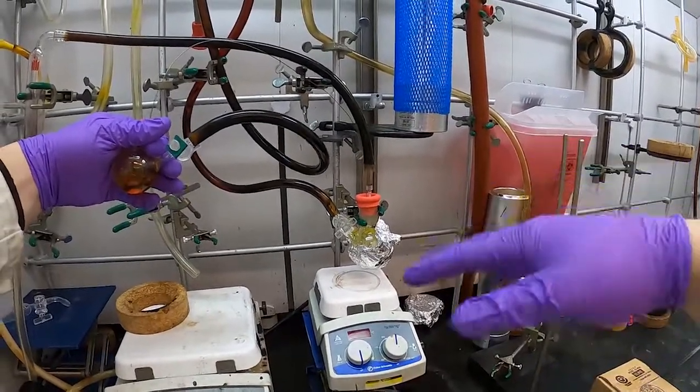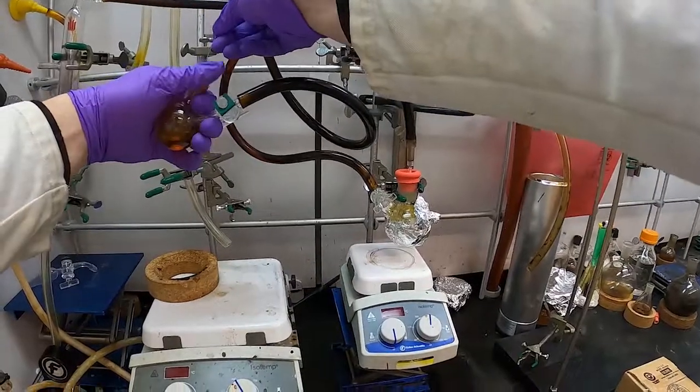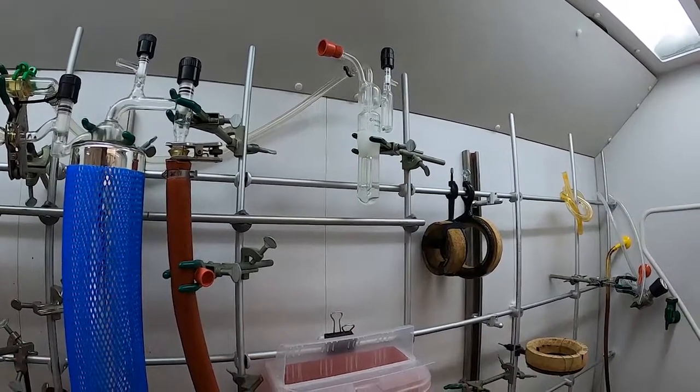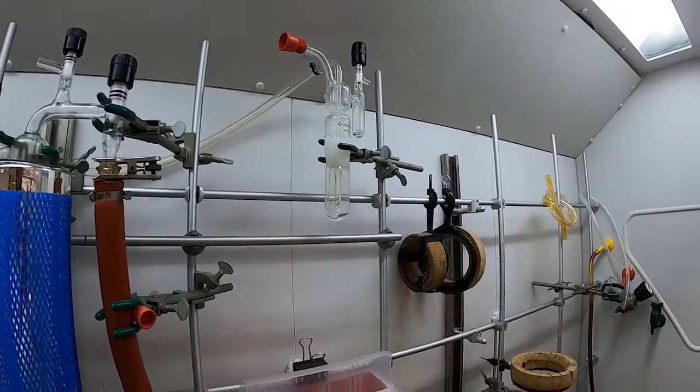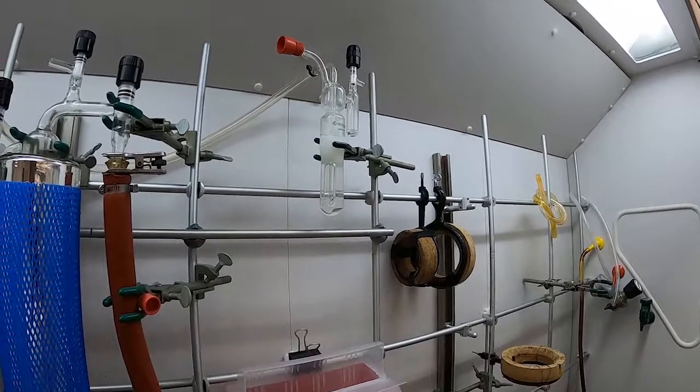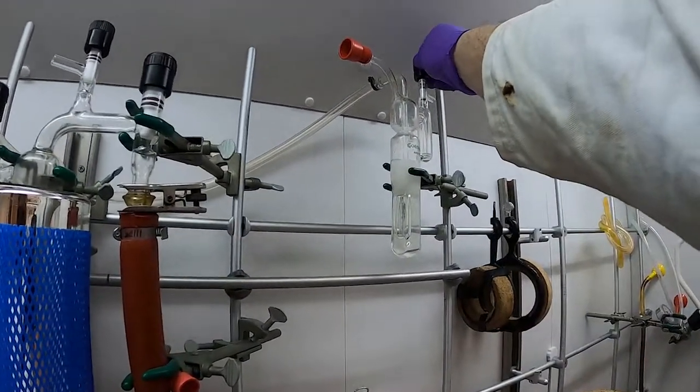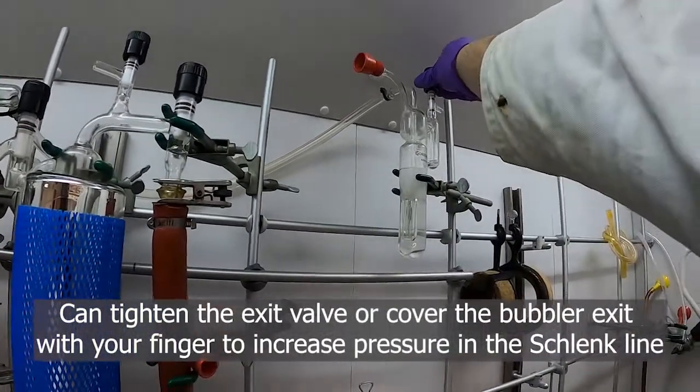We may need to get the nitrogen to push the solution through your cannula. Depending on the type of bubbler you have, if you're not getting the desired flow that you want, if you have one of these screw kind, you can just tighten this valve and prevent some of the nitrogen out of the pressure in your system.